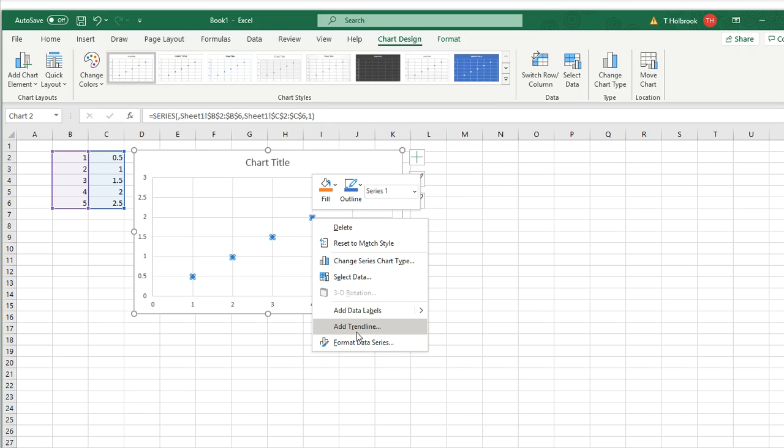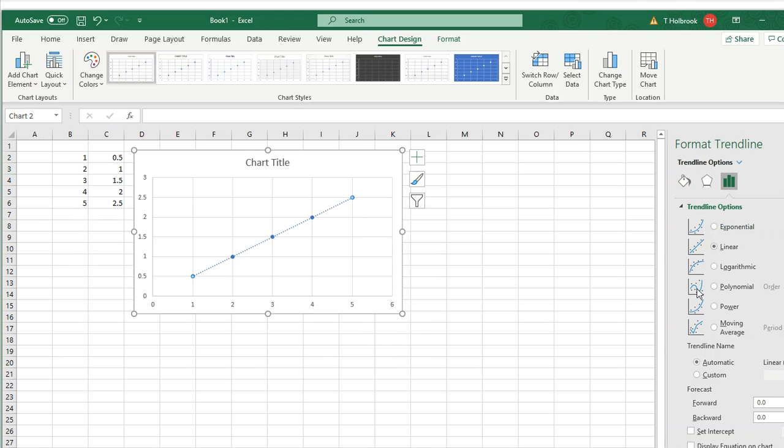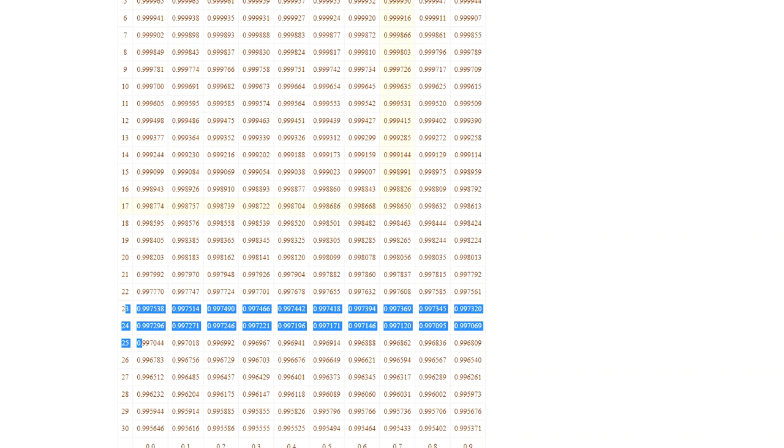We know that data is not perfect. We know that you're not perfect. So Add Trend Line will draw a line and it will try to go through as many points as possible with the assumption that it might not can go through everything, and that's okay for us. So we're going to click Add Trend Line. All right, so when we do this, a box will show up over here on the right-hand side of your screen. You want to make sure that it's linear. There you go.